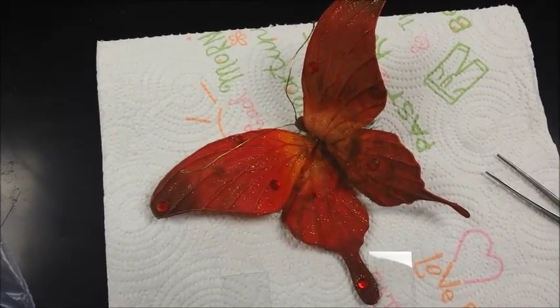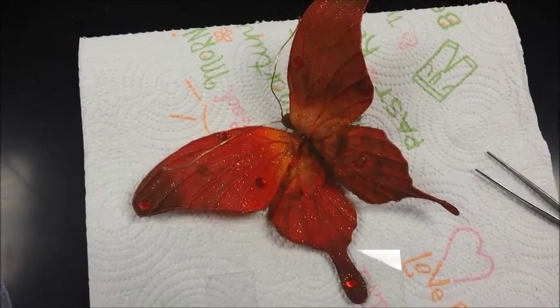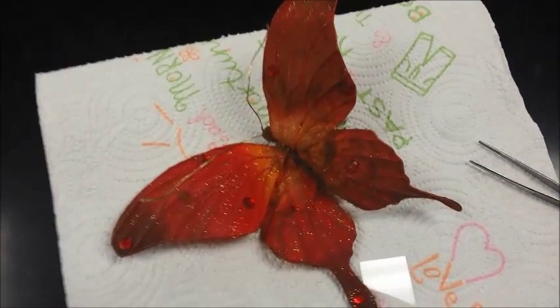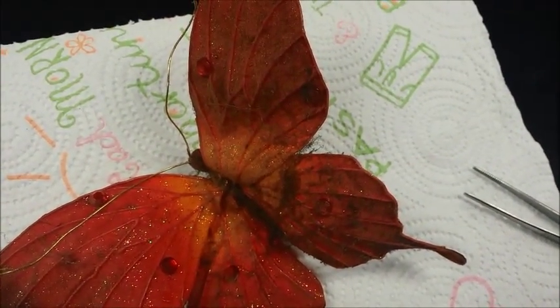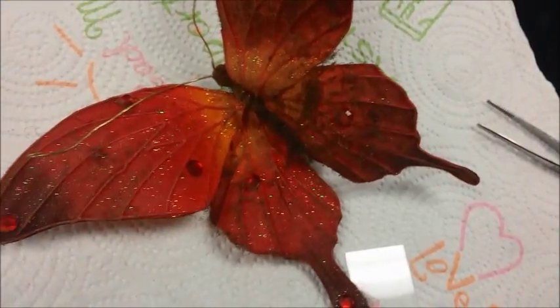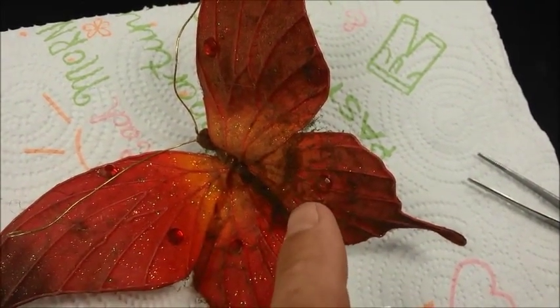Okay, Terry, your geek friend is going to try to help you out. I'm going to try to determine if this funk on the surface of this decorative butterfly, this stuff right in here, is mold. That's what we're going to try to do.